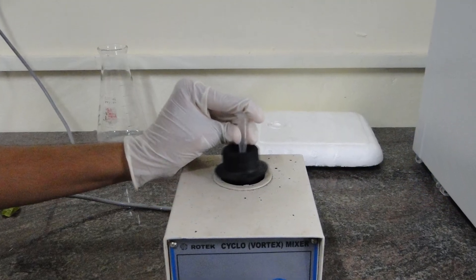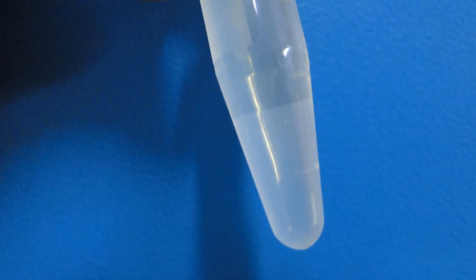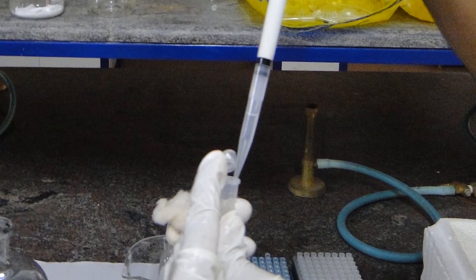Vortex the vial and allow it to stand for 2 minutes at room temperature. Centrifuge it and we can observe the contents in the vial are separated as pellet and supernatant. Remove the supernatant and dry at room temperature.